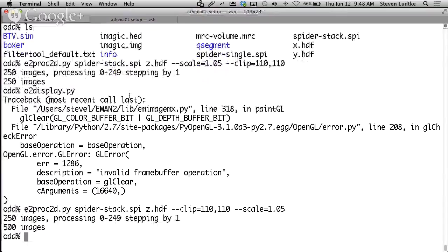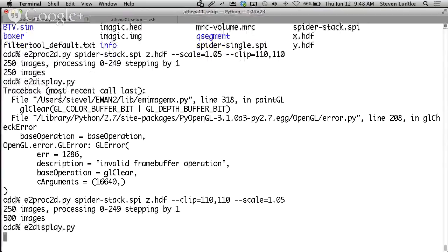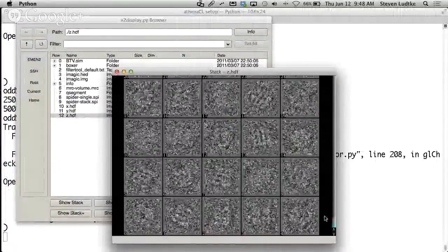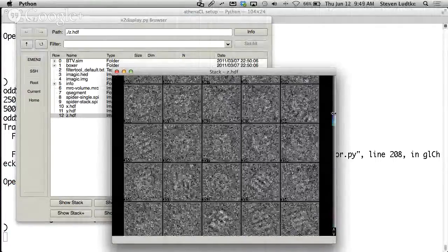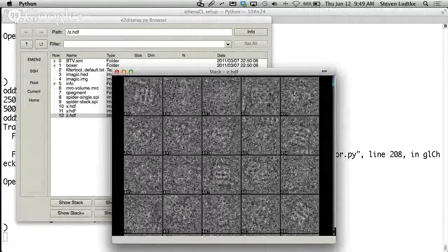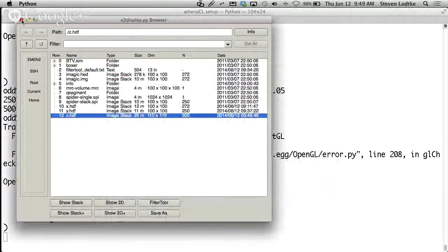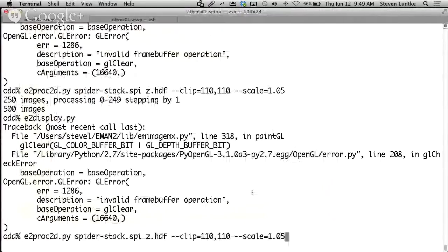Now, again, you can see I didn't use in place, but that's what we want in this case. Okay, so you can see the images at the beginning, which were done the old way, and now the images at the end, which were done the new way, and still have a tiny edge. Oh, sorry. The images were only 100. I made the box too big. It should have been 105, not 110. Yeah, so I still had a little 5-pixel border there.